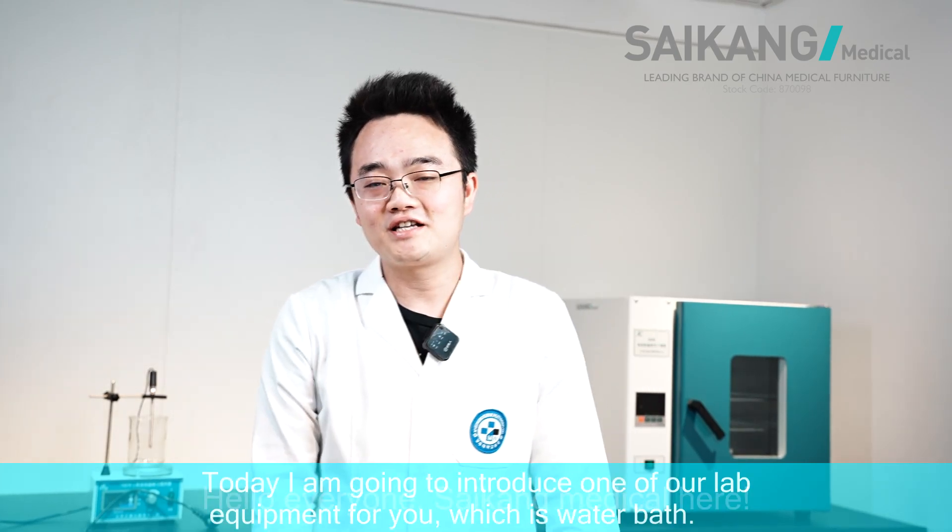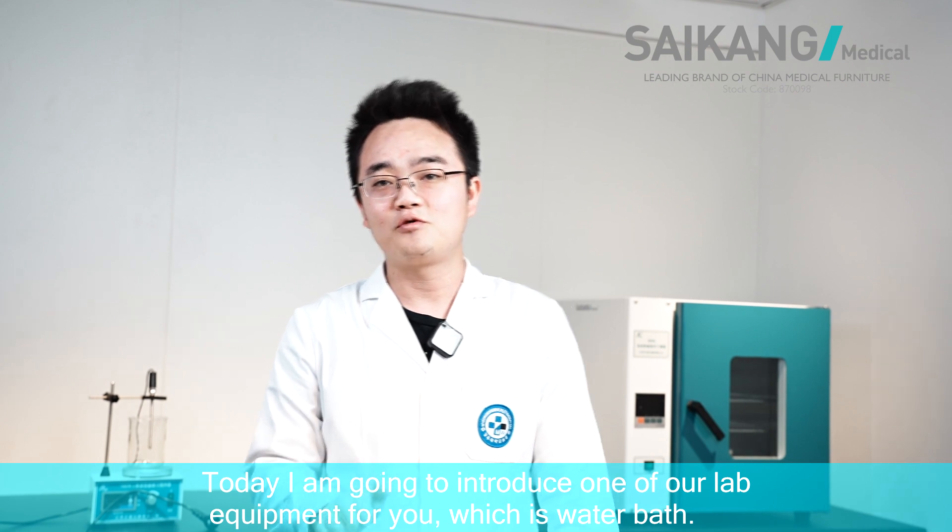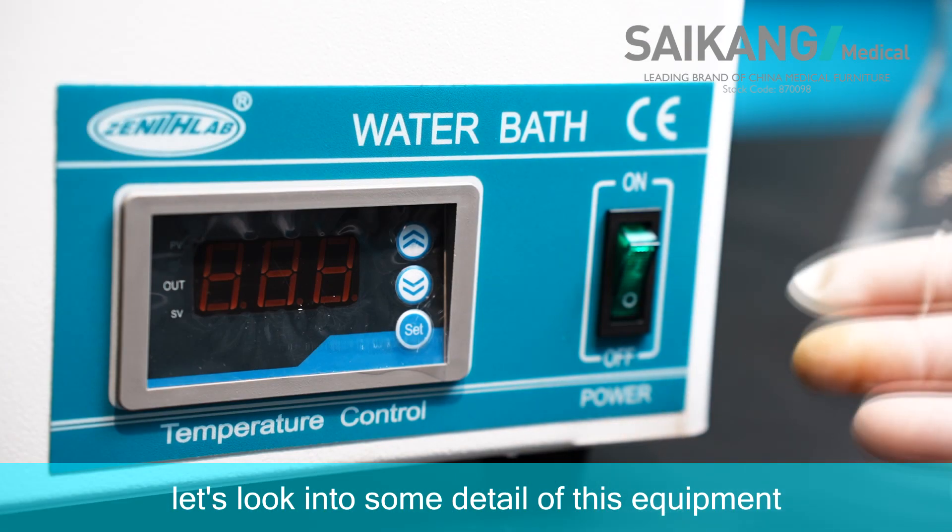Hello everyone, Saikon Medical here. Today I'm gonna introduce one of our lab equipment for you — water baths. Let's look into some detail of this equipment.